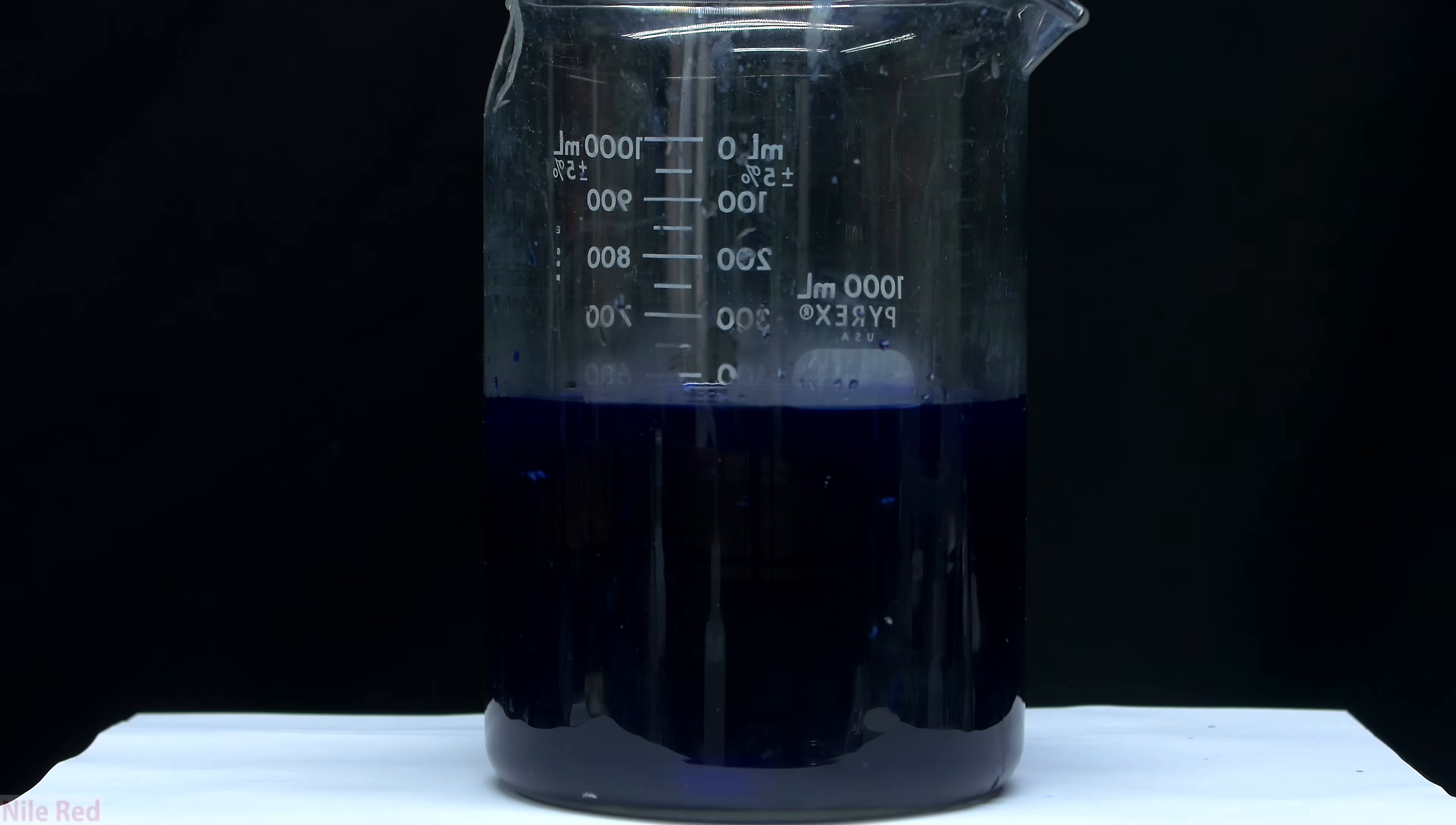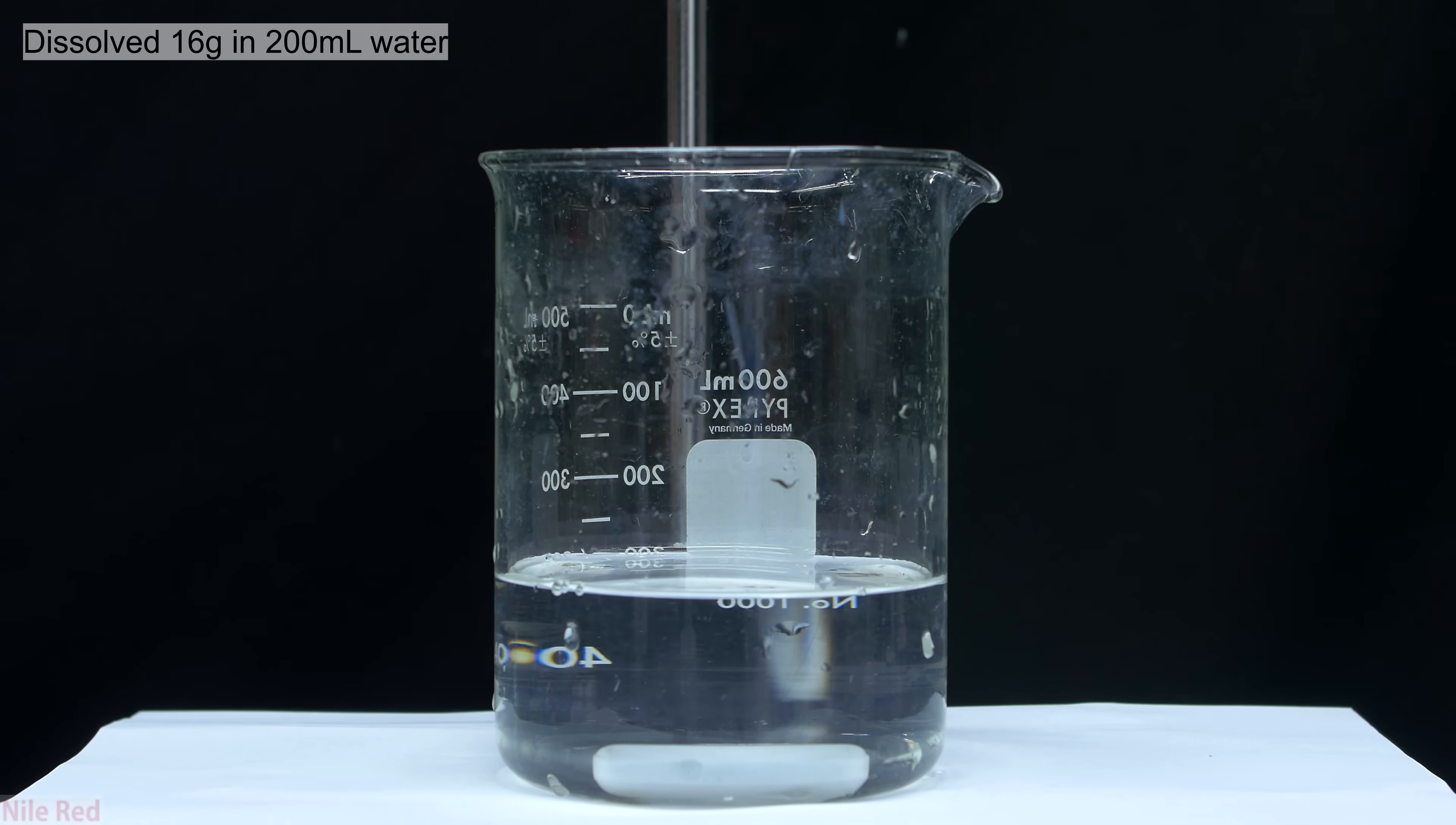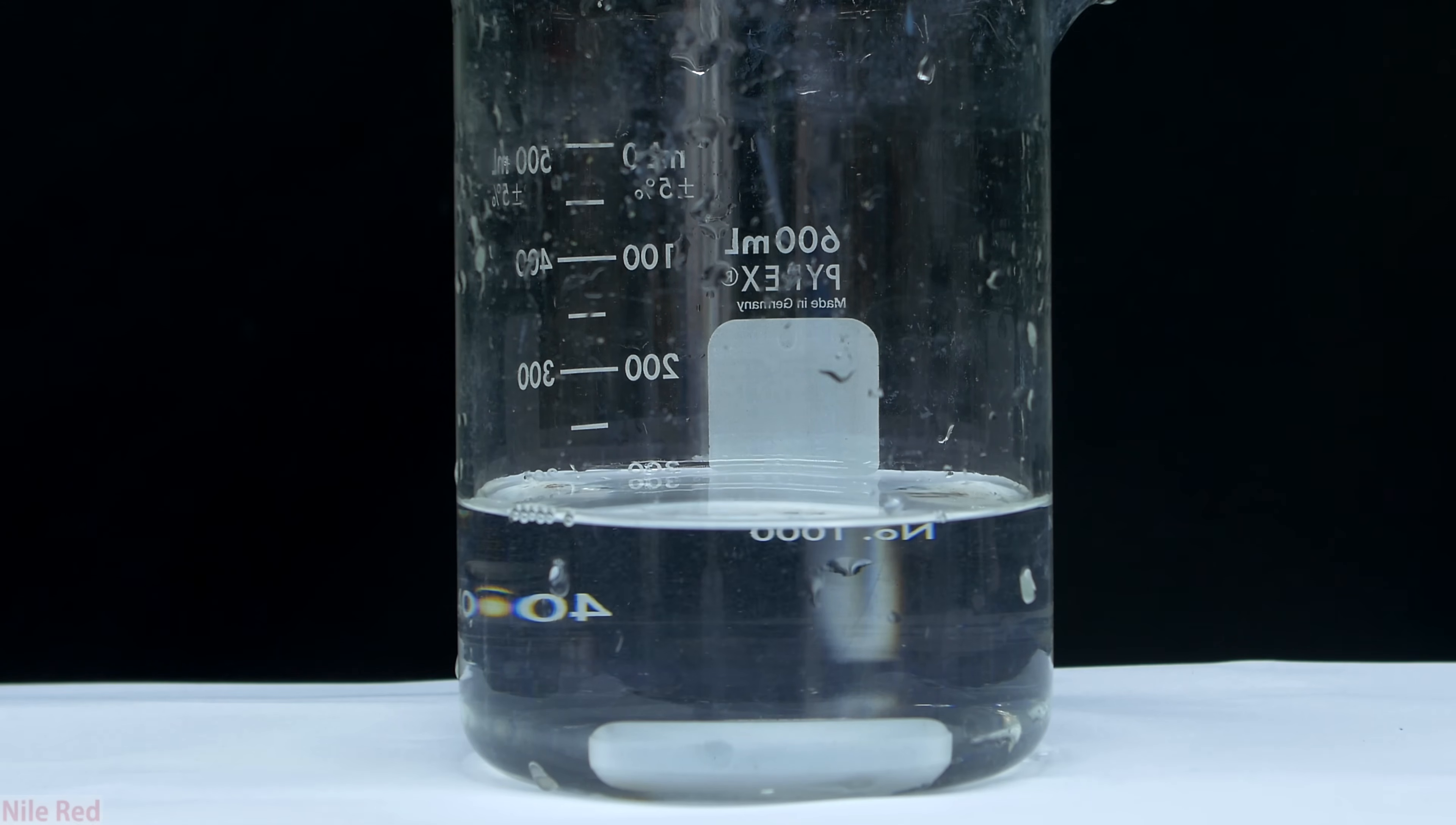Anyway, I let this stir for several minutes, and in the meantime I moved on to making a sodium hydroxide solution. The sodium hydroxide solution is pretty simple to make, and it just involves dissolving about 16 grams of sodium hydroxide in roughly 200 milliliters of distilled water. After stirring it for a few minutes, we should be left with a perfectly clear solution.